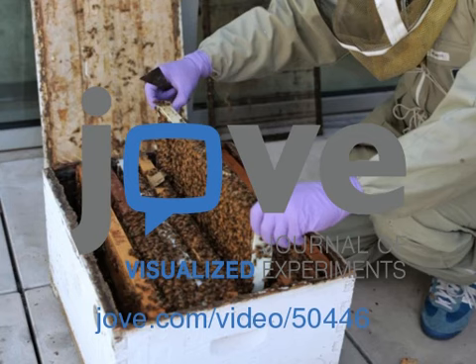Put a disposable 30-gauge needle on a Hamilton microsyringe. Fill the syringe with 3 microliters of double-stranded RNA and make sure there is no air bubble in the syringe. If a single injection strategy is used, the syringe is filled with a mixture of the double-stranded RNAs of the 2 genes. If a 2-day injection strategy is used, the syringe is filled with one of the 2 double-stranded RNAs.